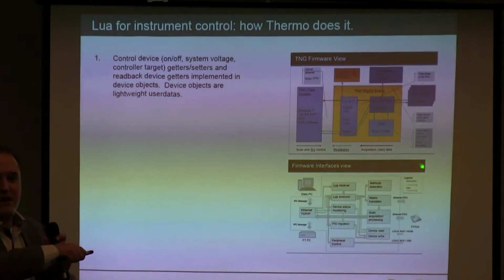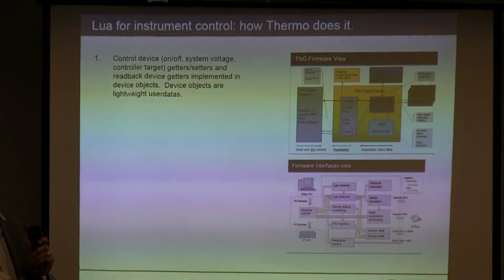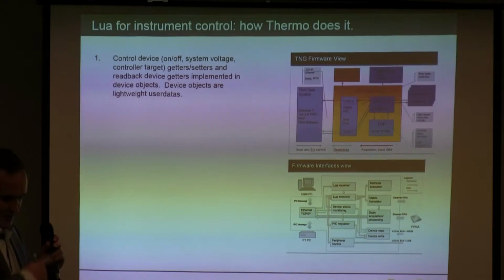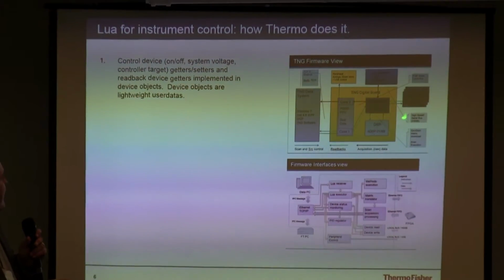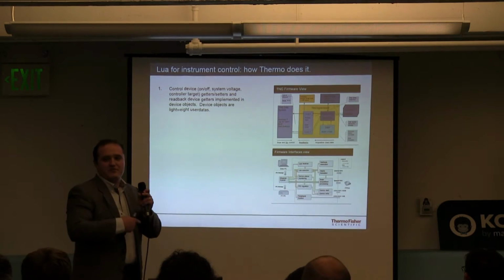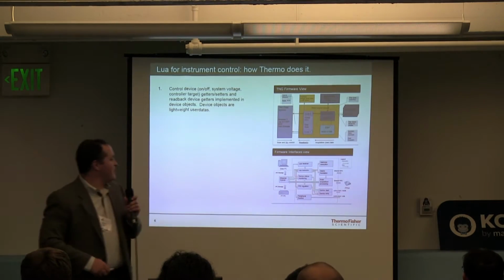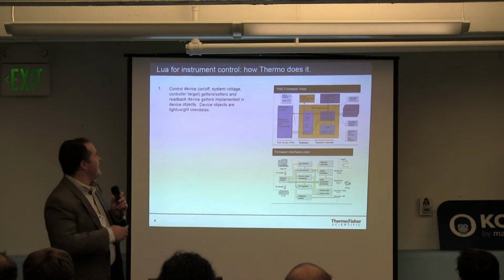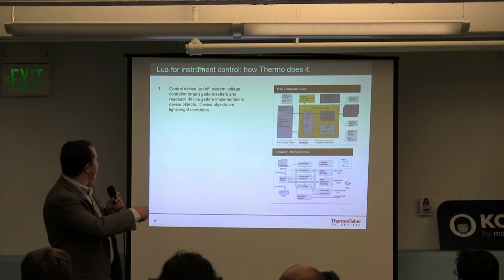On this we run an embedded Lua. We have the C routines that are very basic, and they run a continuous loop, controlling PID control devices, consuming any data that's sent back, and monitoring the system for errors. And then in that loop cycle we execute the next Lua command, execute the next Lua command, to the point where if you're writing for this instrument in the Lua layer, it looks like an extension. Everything you do is controlled. Whether or not you are going to take a scan is controlled by the Lua.